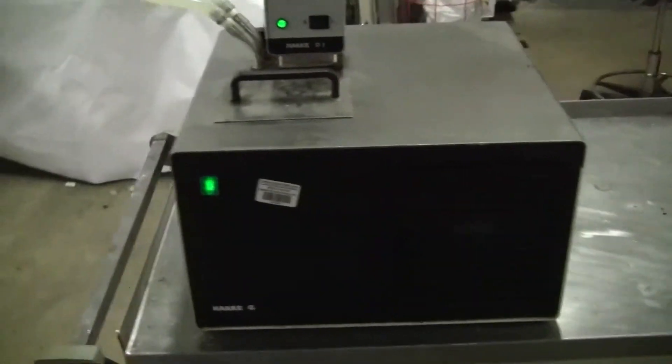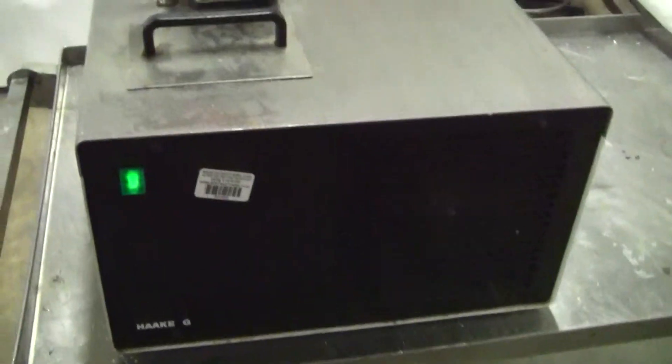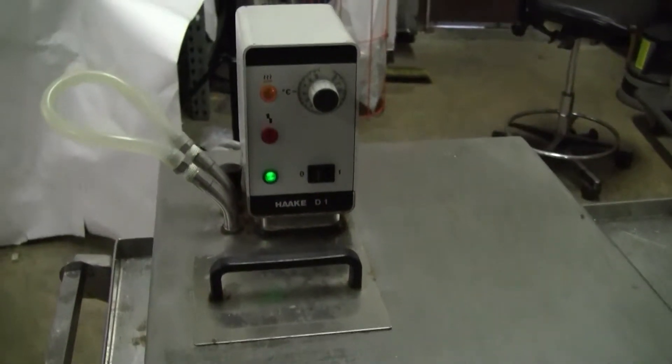Hi, this is Michael Natal from High Tech Trading. Today we're looking at a Haake G unit with a D1 controller — a classic recirculating chiller.